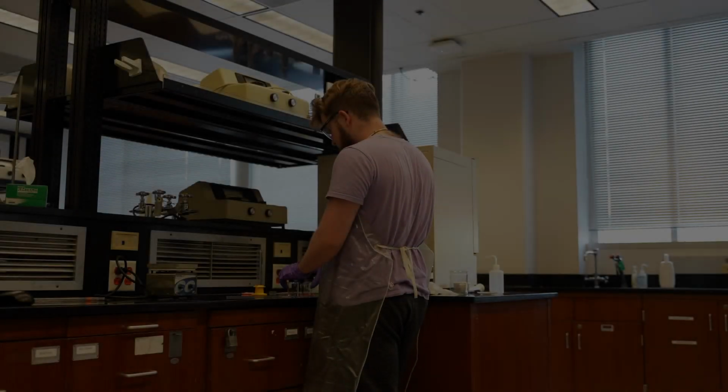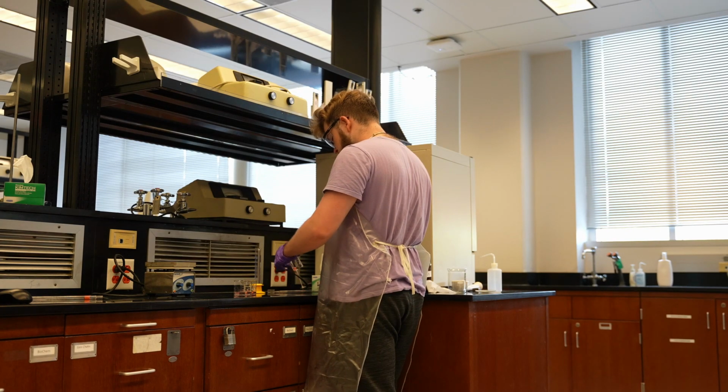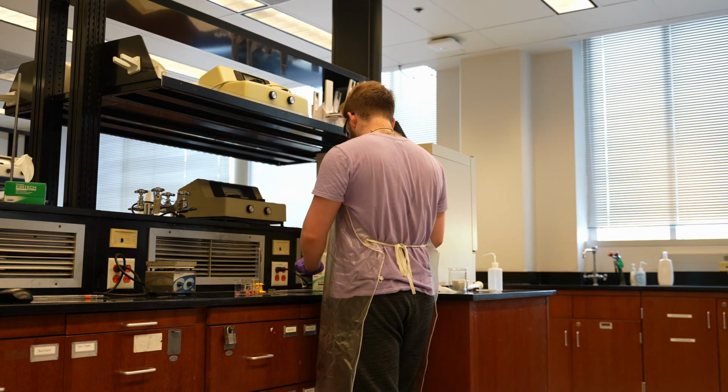Hello. Within this experiment, you use what's called a spectrophotometer to record data that quantifies color. Just as one can quantify mass with kilograms, we can quantify color by measuring the frequency of visible light waves, as well as how efficient a substance can absorb light by manipulating related properties found within today's experiment.